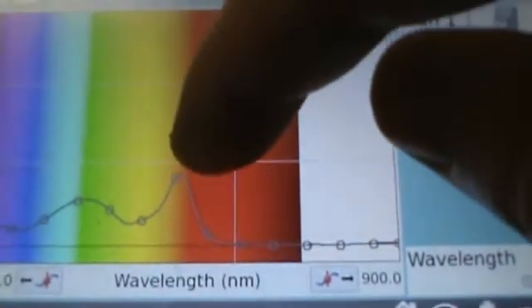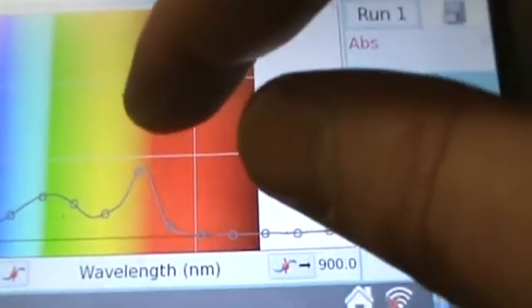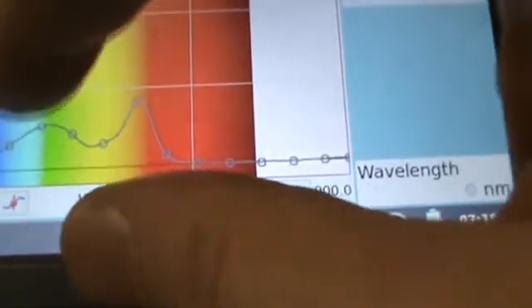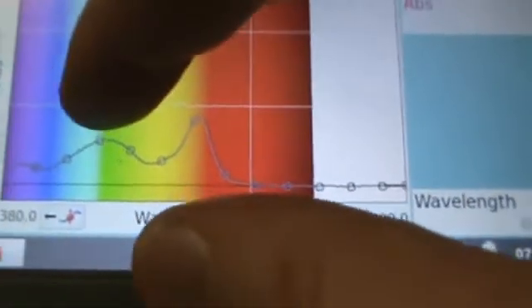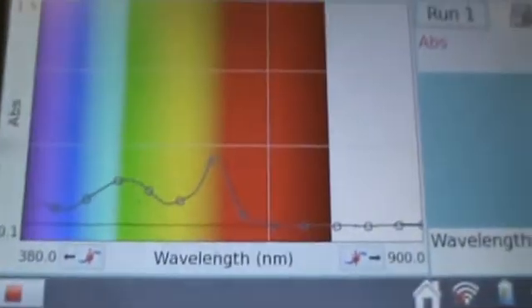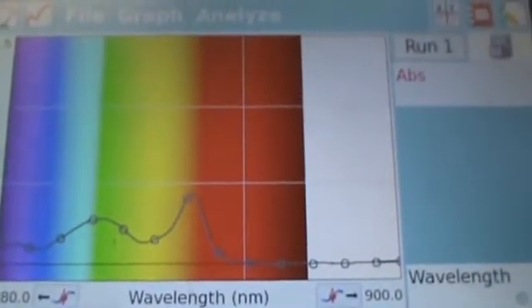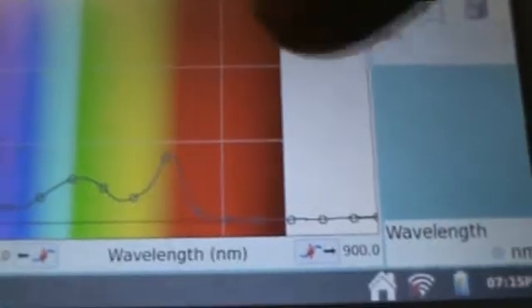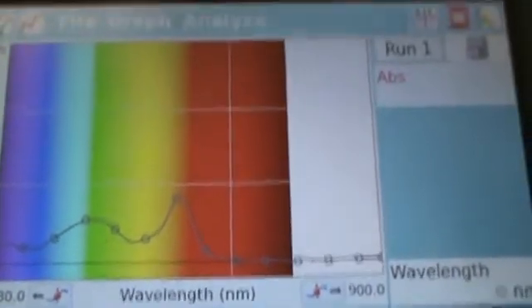The orange peak here is from the blue food dye. The blue-green peak over here is from the other one. You can see that this one has not been separated yet, unlike the other two.